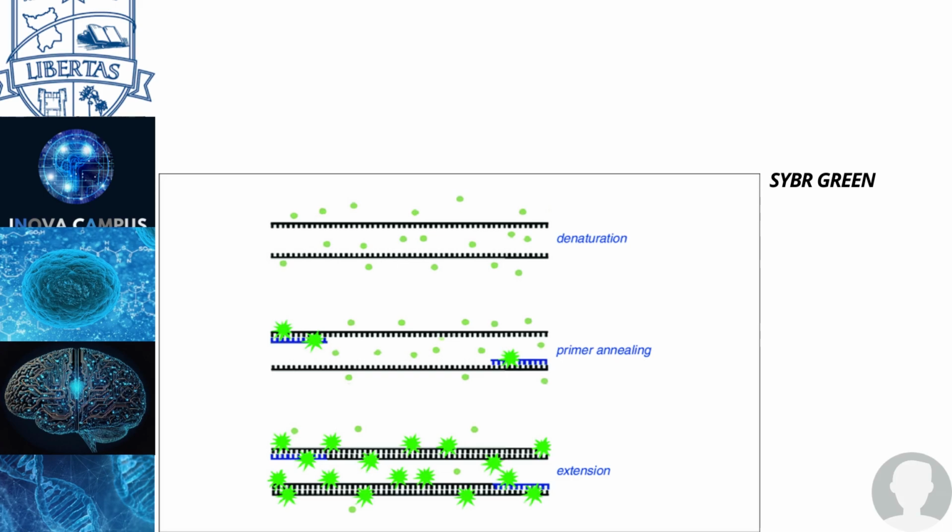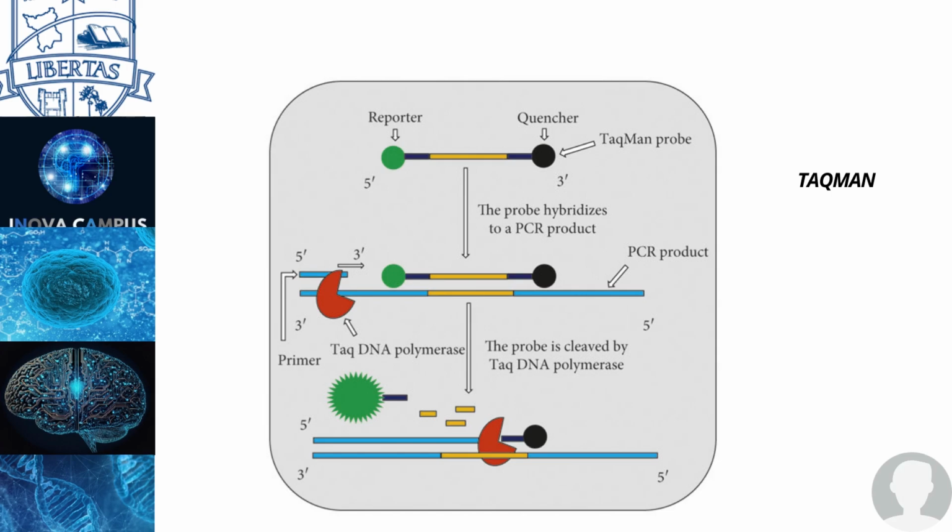So there is another technique, and this technique is newer. I would say it is very fancy, very elegant, like our Dr. Igor Nasser says. It's very elegant, and it uses a probe called TaqMan, as I'm showing you right now in the slide. So TaqMan is a reaction method that will use two primers and the probe, like I said, the on segment. And this probe has in its composition two ends.